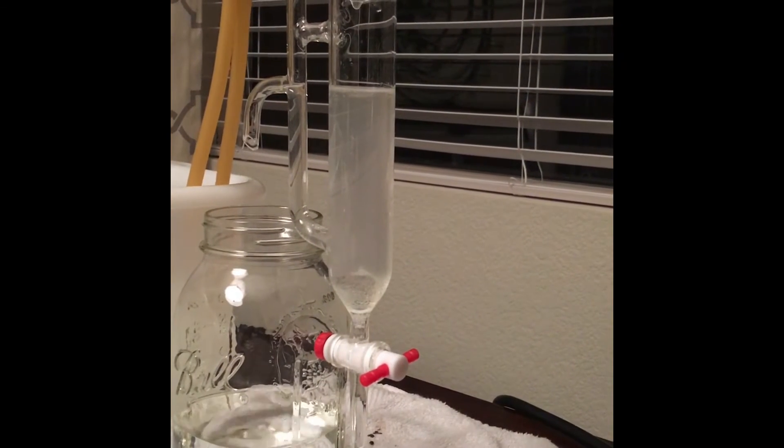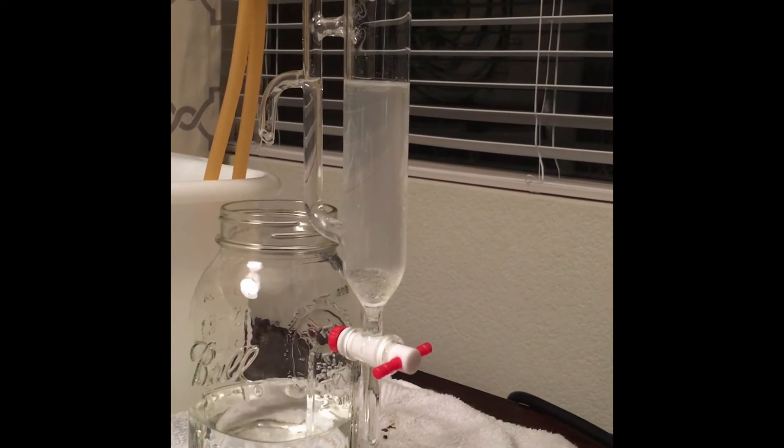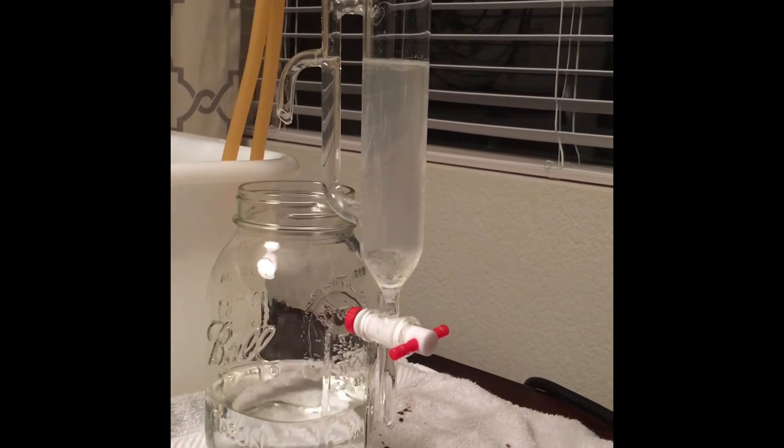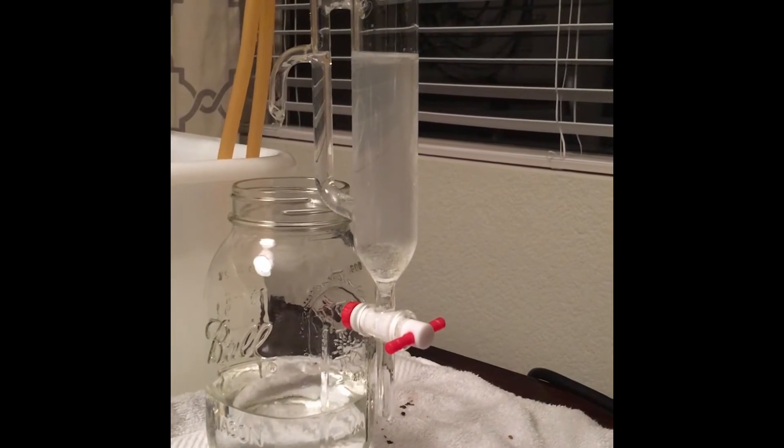At this point, after about three hours, all of the essential oil has sunk to the bottom. I'm going to turn everything off and let the separator clarify.